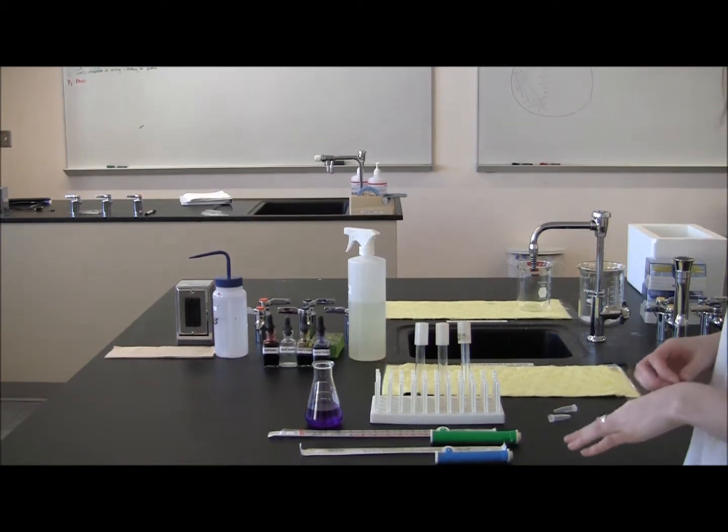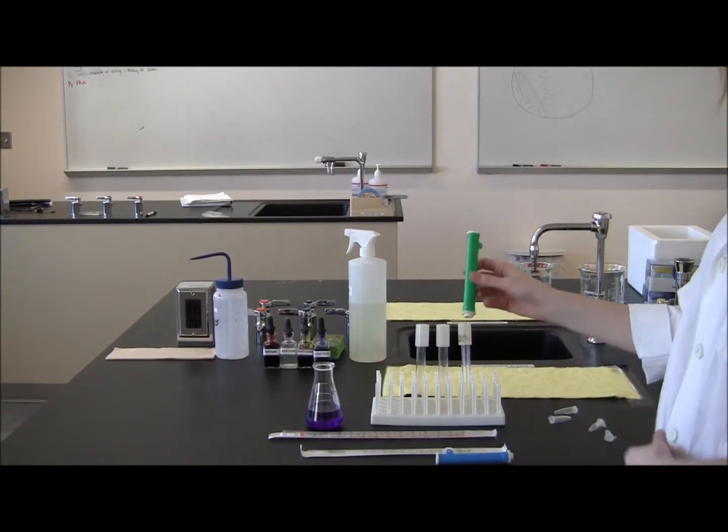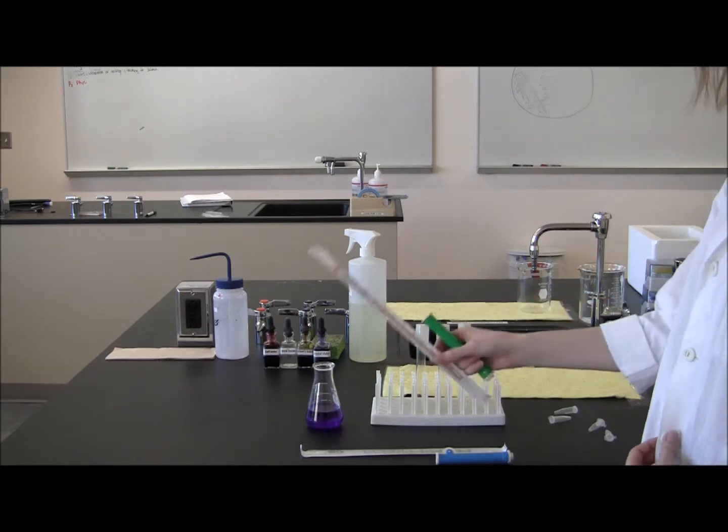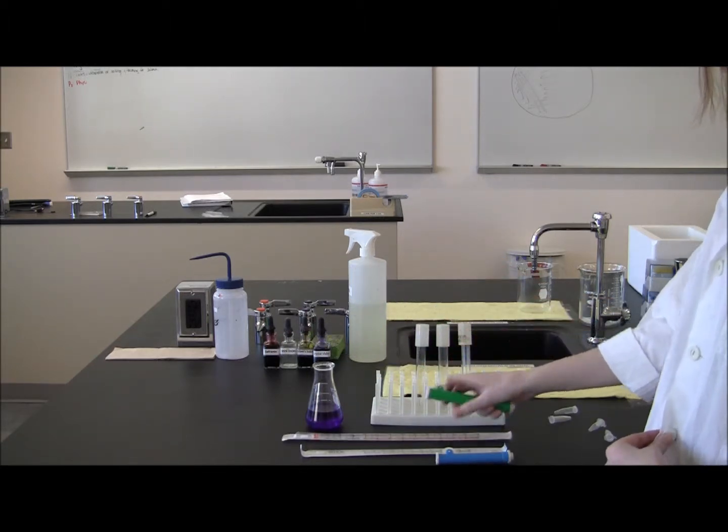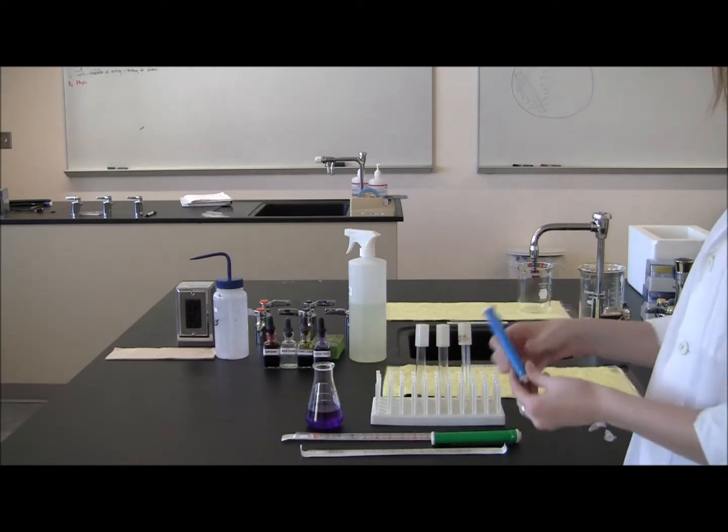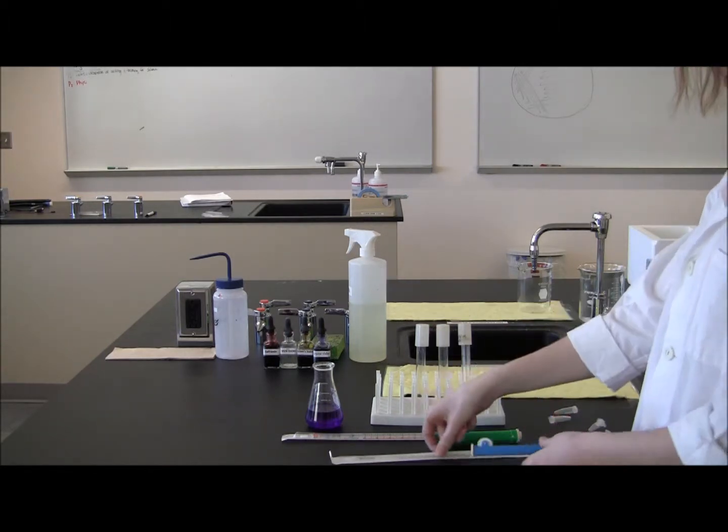So now we're going to talk about pipetting. The green pipet is used for pipetters that are 5 mils or above, and the small blue one is used for a 1 mil pipet when you're pipetting smaller volumes.